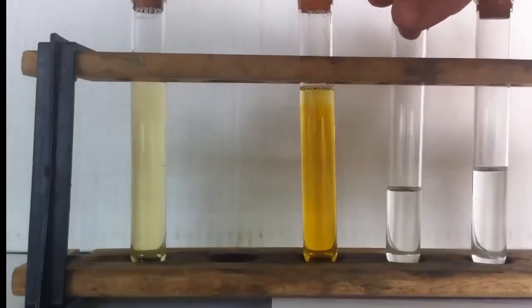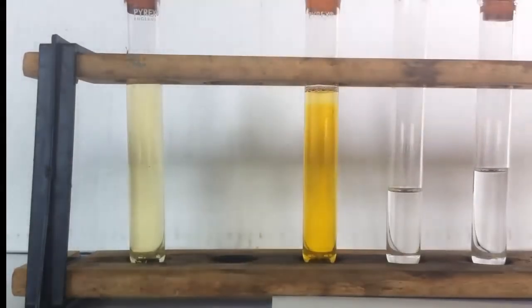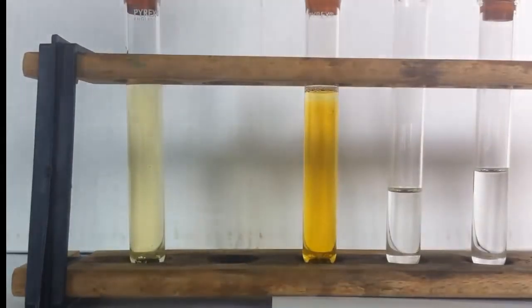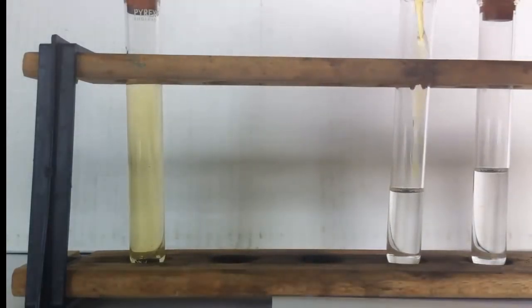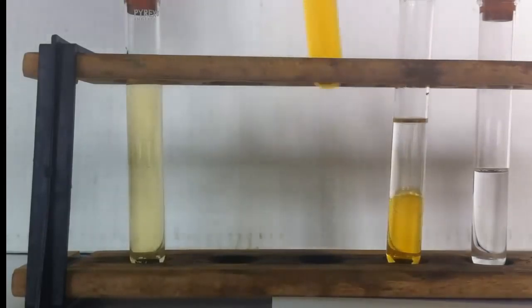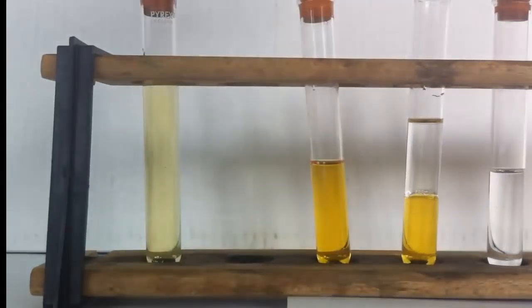So I'll remove the bung here from the test tube containing the cyclohexene and add roughly the same volume of bromine water. In it goes. Put the stopper on here.